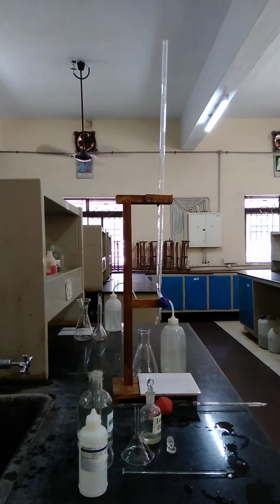Burette solution, pipette solution, additional reagent, indicator, endpoint. That is the first column. Okay. In the second column, titration 1, and third column, titration 2. So as per titration 1, burette solution is sodium hydroxide, pipette solution is oxalic acid, additional reagent, no additional reagent, indicator, phenolphthalein, endpoint, appearance of pink. As per the same, titration 2, burette solution is sodium hydroxide, pipette solution is HCl, additional reagent, no additional reagent, indicator, phenolphthalein, endpoint, appearance of pink.